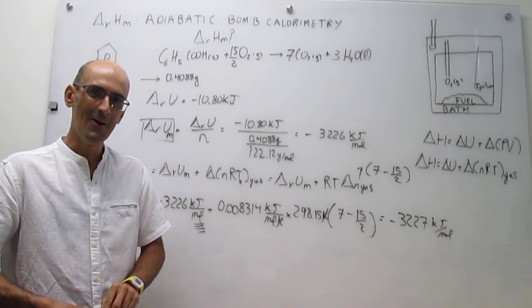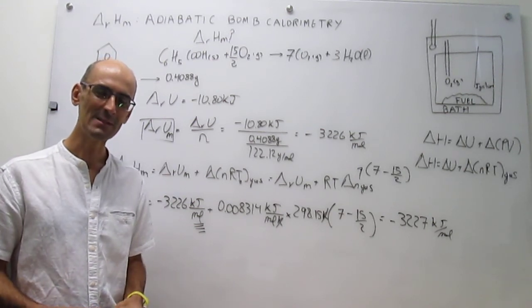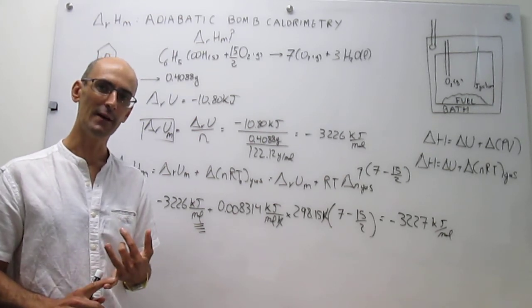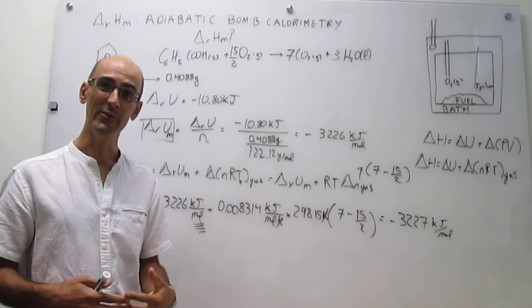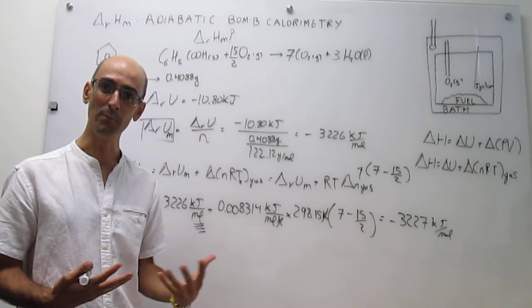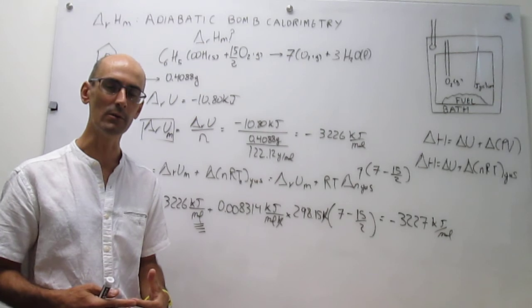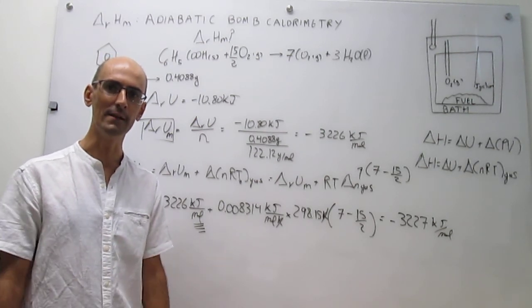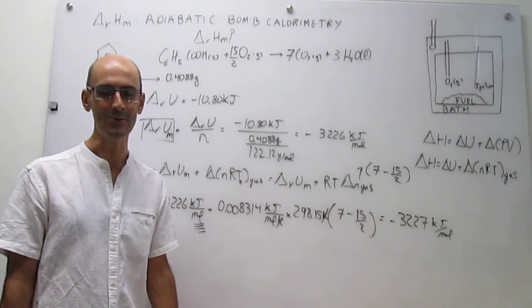Okay? All right, so this has been a long video, but hopefully it has been a useful one, in which we have seen first the basis of adiabatic bomb calorimetry, and then we actually have completed a full analysis of a problem so that you can understand the ins and outs of how to find the enthalpy of a reaction using this technique.